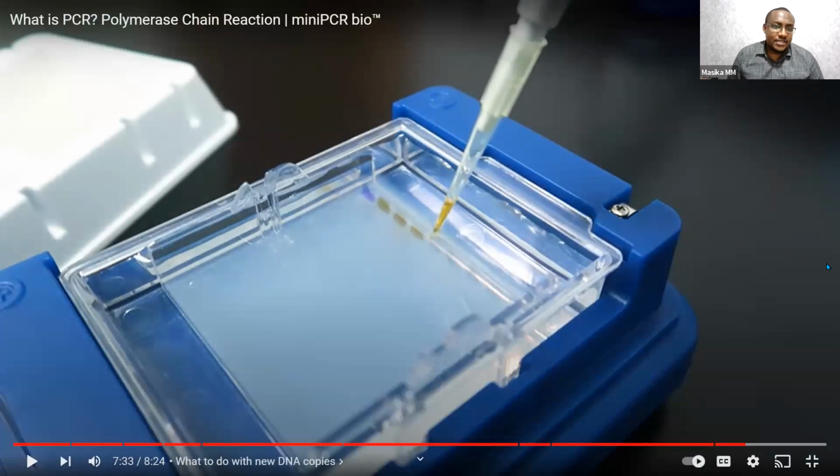So this here is your gel. You can see the gel is basically some powder. You prepare it in a microwave by mixing with water. You cool it down in this trough. And if you put in a comb, it makes wells. You can see these yellowish or orangish holes on the gel are called wells, where you put in your sample that already has a dye, and the dye usually binds to DNA.